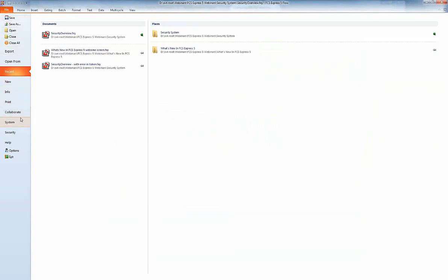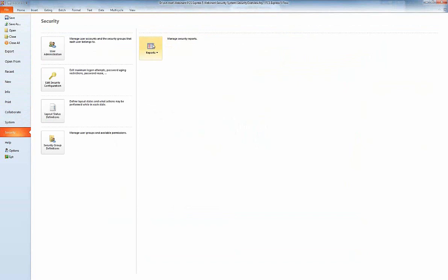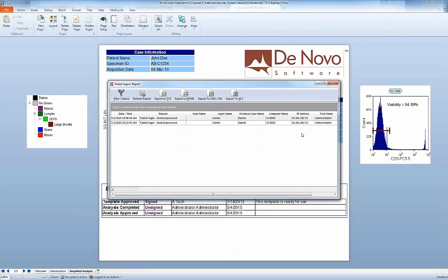We have other reports as well that you can take a look at. So under Security, under Reports, you can find out all of the people whose login has failed. And you can see there are two items in this report from when earlier in this presentation I was trying to log in and put in a wrong password. Again, it's gathered the information, the date and time, and I can export this, filter it, and so on. And you can collect reports of whatever event, how many people are logged in, and so on, and keep track of the usage of your system.